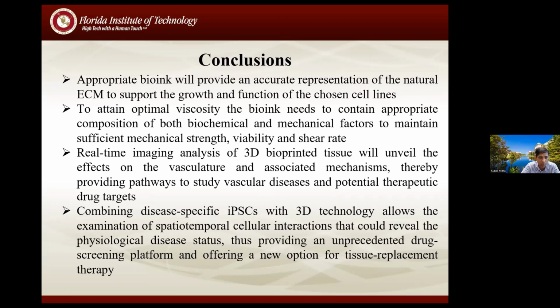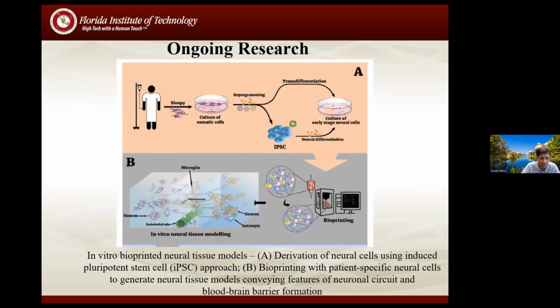So that is the key for personalized medicine, and that's the one we'll be doing for our tissue chip for flight experiments. We are looking at iPSCs right now in our lab. We're also going to work on a neural brain model, because that's going to be used for aging. So we are looking at neural cells and bioprinting with specific neural cells. We want to add more complex astrocytes and others, but we just have the neurons. It's a complex process optimization.